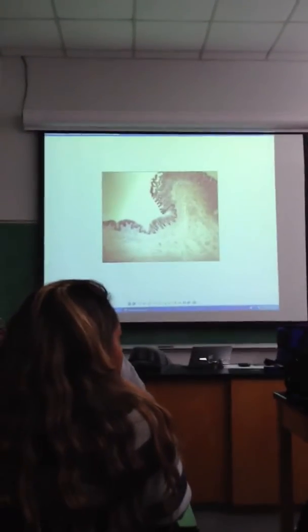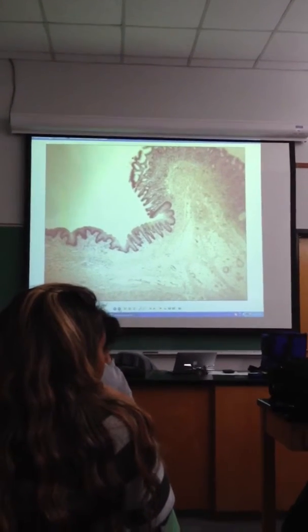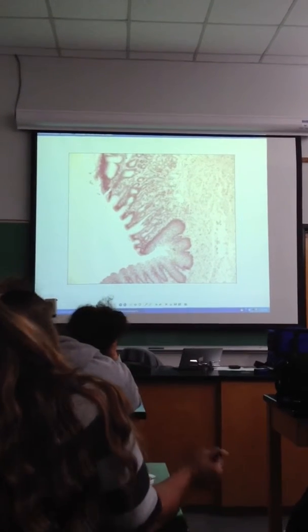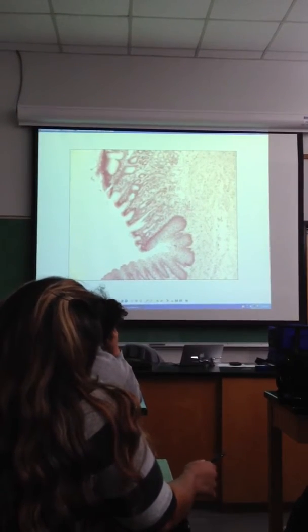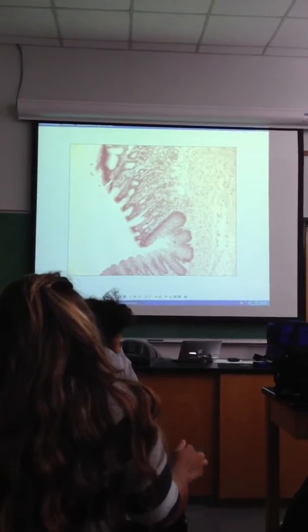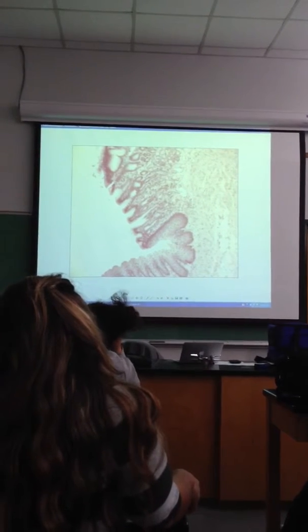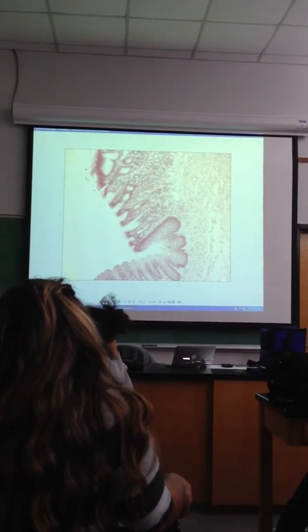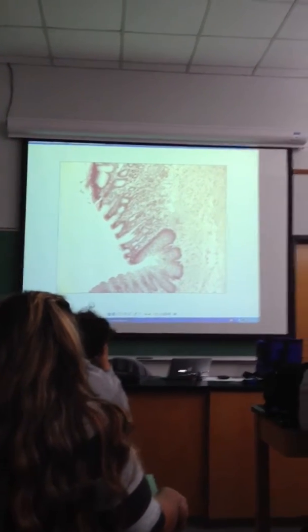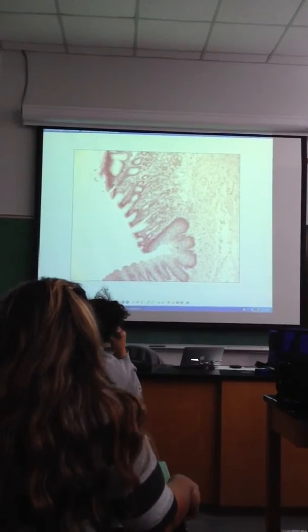Next up, we're going to see where the stomach meets the esophagus. That is called the gastroesophageal junction. If you look at one half of it, over toward the left-hand side, bottom of the screen, it looks more like what we just saw, the esophagus. That's because it is the esophagus. But if you notice, it's kind of a hard division as you move superiorly, and then you cross that division, and it doesn't look like stratified squamous epithelium anymore. That is the beginning of the stomach. Like I said, this is a gastroesophageal junction. Gastro for stomach, esophageal for esophagus is what the two mean.